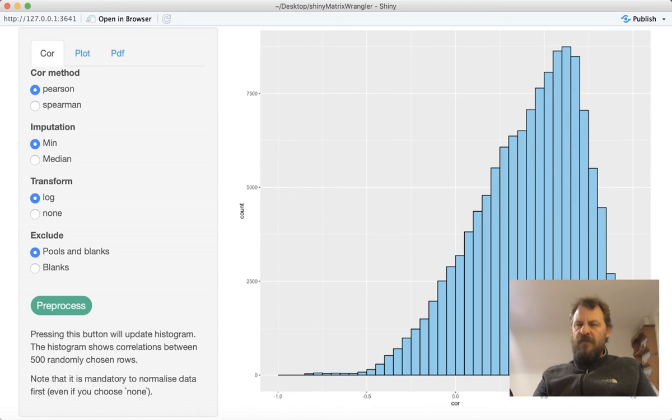This is not right. Why are all these features correlated? Of course, there will be some features that really should be correlated and are correlated, for example, C13 isotopes, and so on. But most of them aren't and shouldn't be.